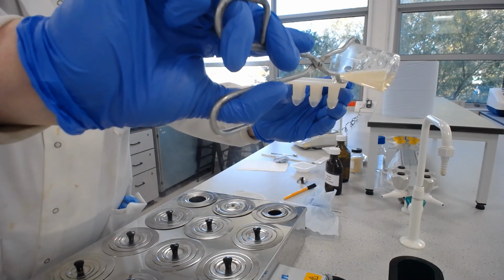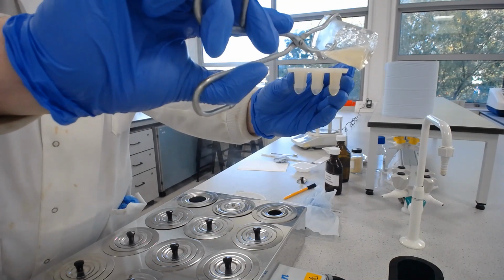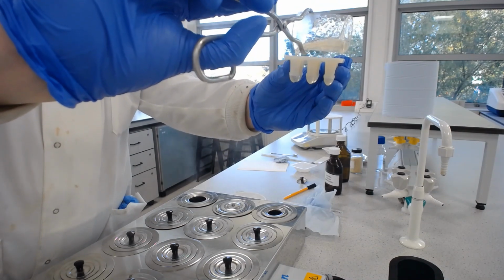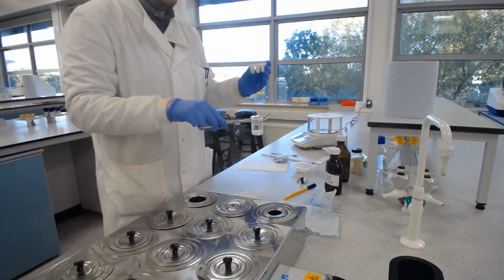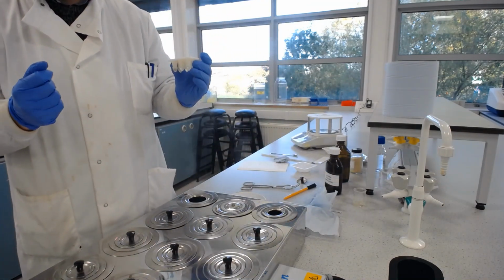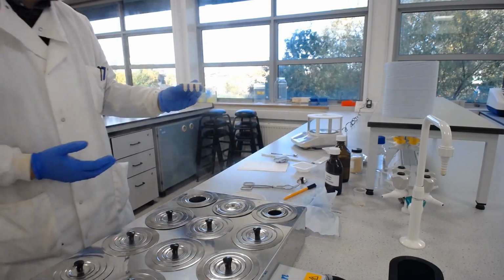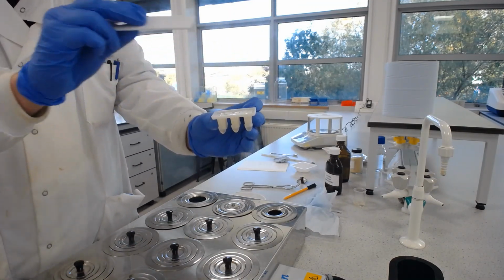Now there's no contraction of gelatin when it cools down, so we don't need to have an excess. We don't need it to be bulging over the top. Obviously if you get a bit of a bulge, that's not a problem, like I'm doing there, you see there's a bit of a bulge. There we go. So I've got an excess there, but remember I still had a bit too much water in that. So these suppositories will probably be a bit flimsy because there's probably a bit too much water content still in them. But you can see on the top there I've got a bit of an excess, but that's no problem. Once that cools down, to make sure we've got nice even suppositories, we'll scrape across the top of them and then we'll get them out.